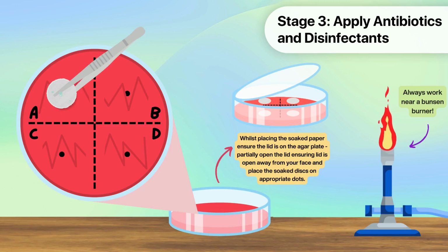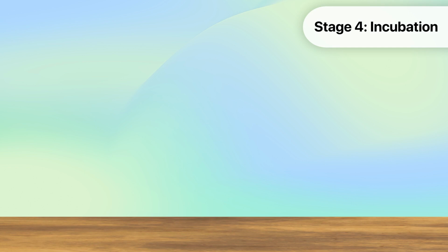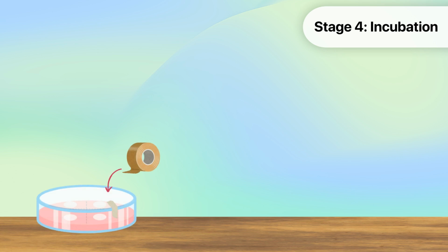This prevents any unnecessary contamination. In our next stage, we need to incubate the agar plate. Before we place the agar plate in the incubator, we need to ensure that it has been taped properly.